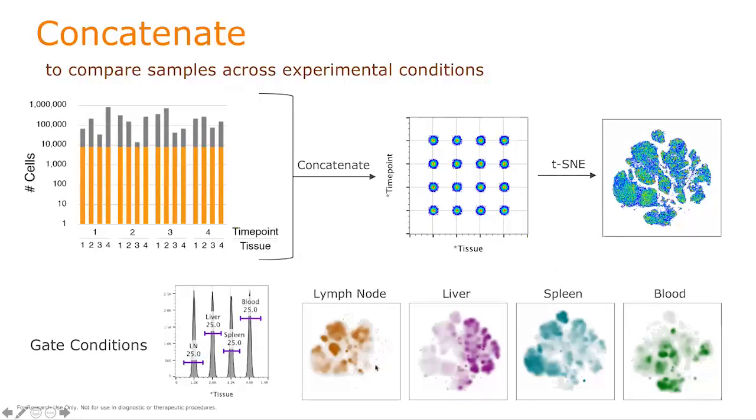And then breaking that out, I've shown these plots before, but you can easily see regional expression in the different tissues that correspond to the different cell types. Lymph node has more Bs, 4s, and 8s. Spleen has some special B cells. Liver has a bunch of innate cells and CD8s. Blood has 4s, 8s, NKs, and monocytes, and some Bs, but they're slightly different in phenotype than the others.